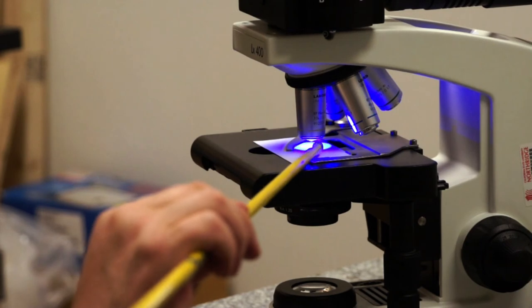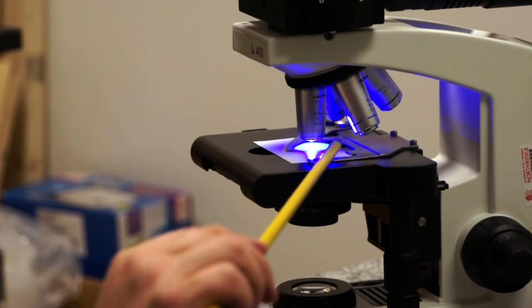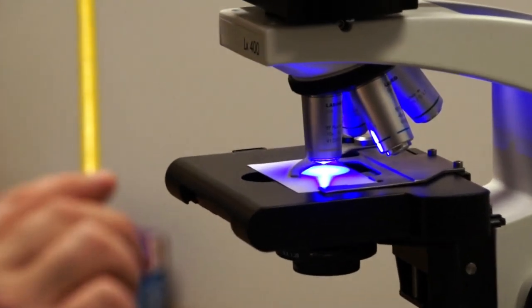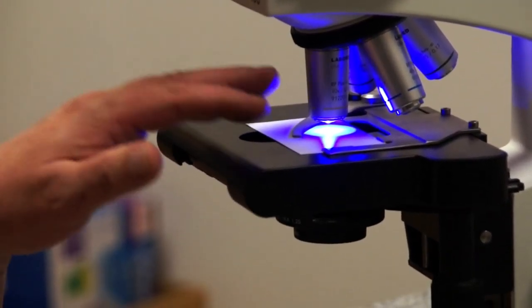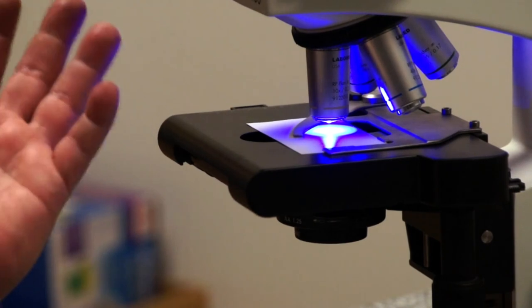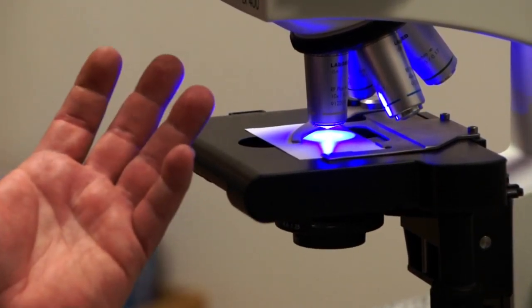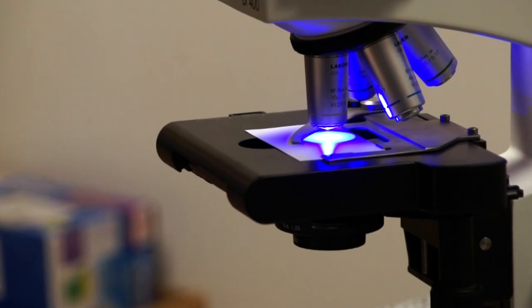We'll discuss more about excitation and emission later. But the light that comes off the specimen, or the emission light, travels through the objective and to the observer's eyepieces. This is very low light, and therefore you will often see a fluorescent microscope used in a dark room. Now we're going to go to the diagram and show you these features on the diagram as well.